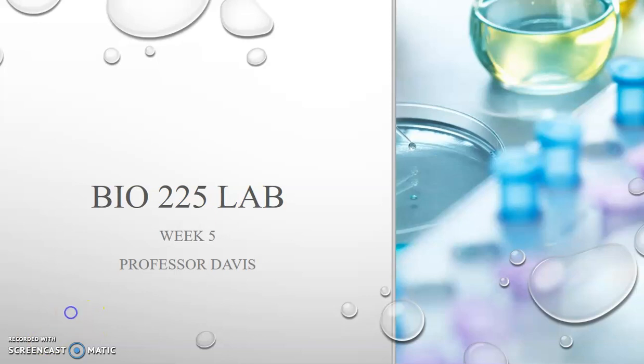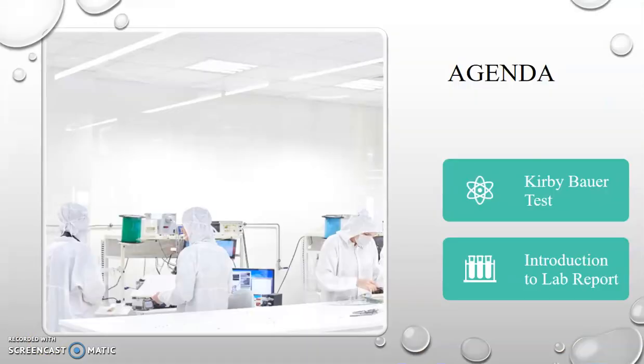So this week we are going to be talking about the Kirby-Bauer antibiotic susceptibility test, and this is also the week that you are introduced to your lab report.